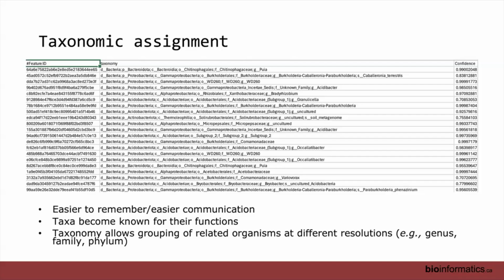Honestly, you often have a quick look through these and see if they seem reasonable and then move on. For amplicon sequencing, when you're looking at a short region, we typically aren't looking below the genus level. Once you're looking at the species level, you'll find maybe 20 or 30% of your ASVs actually have a species level classification, so I think that's why the confidence isn't always as important.